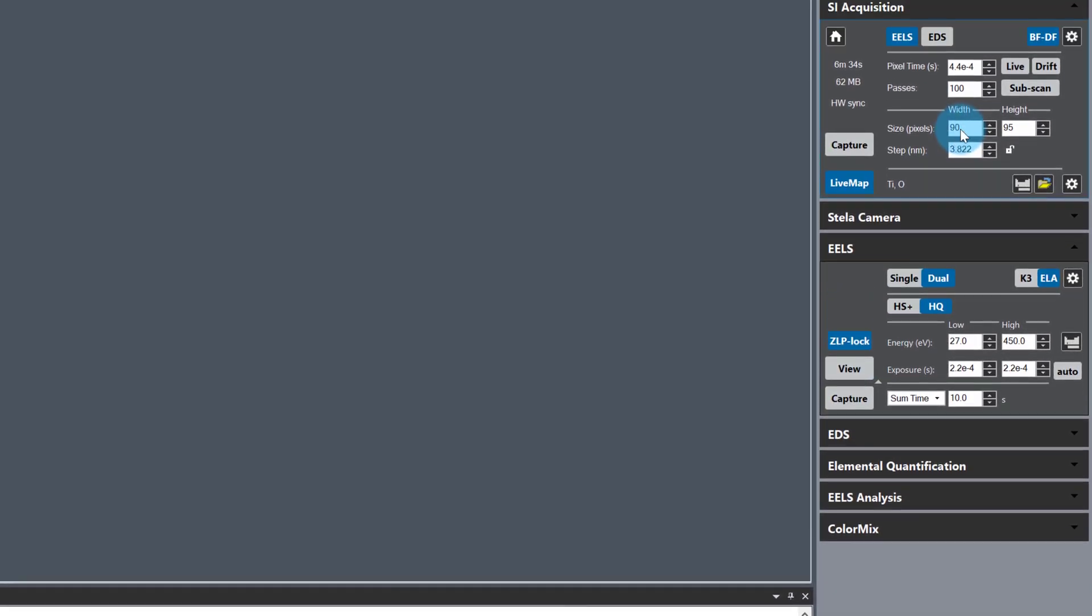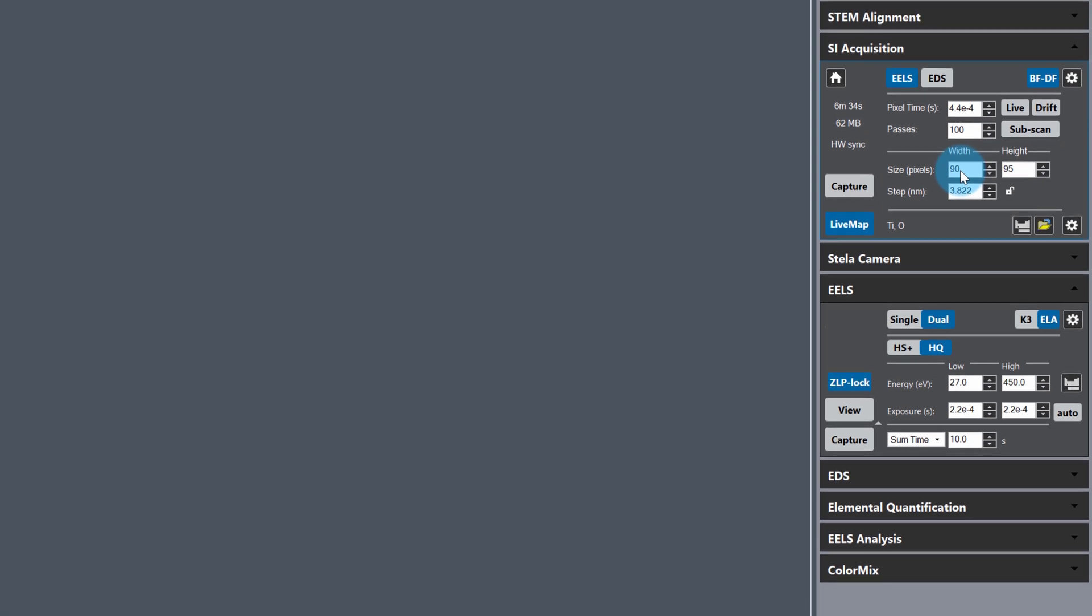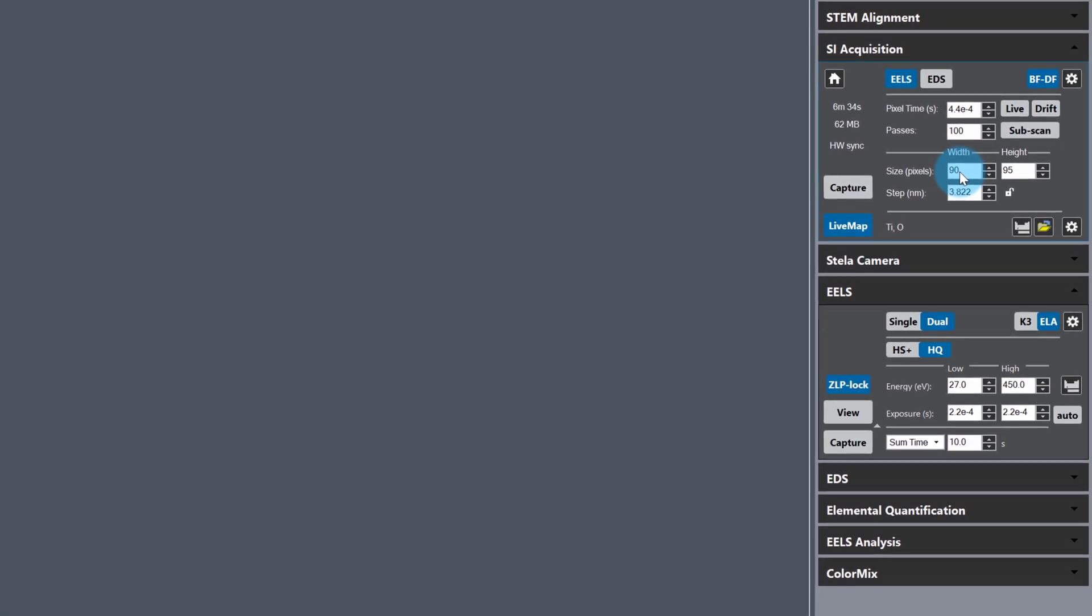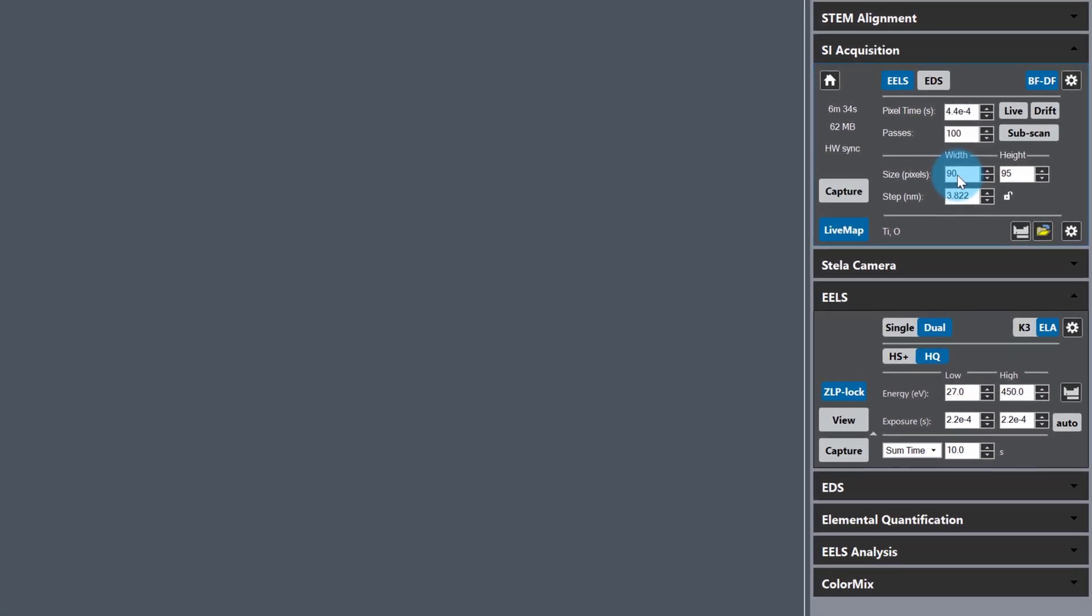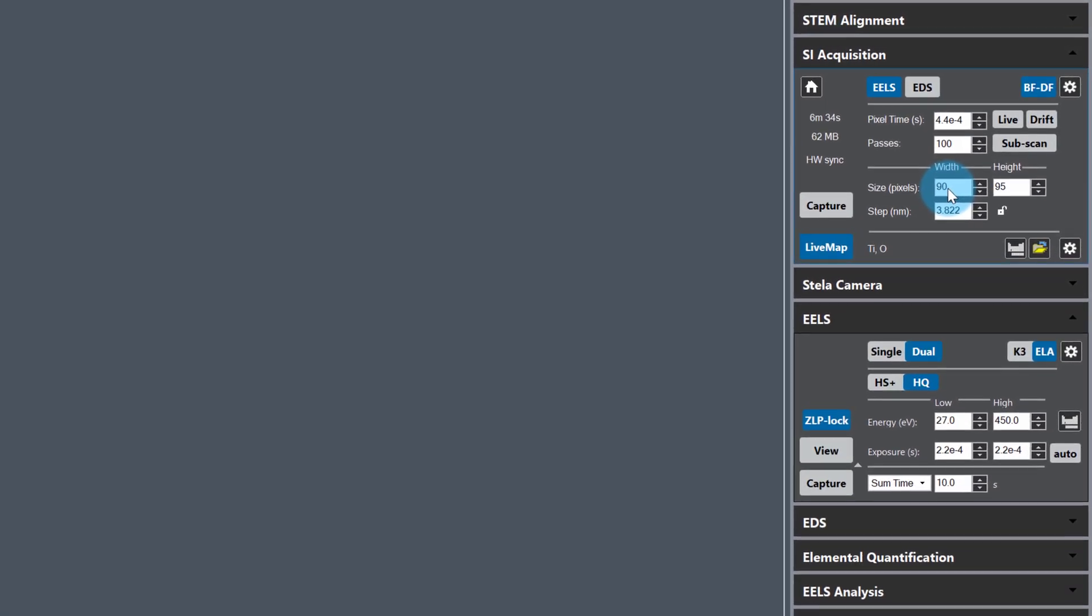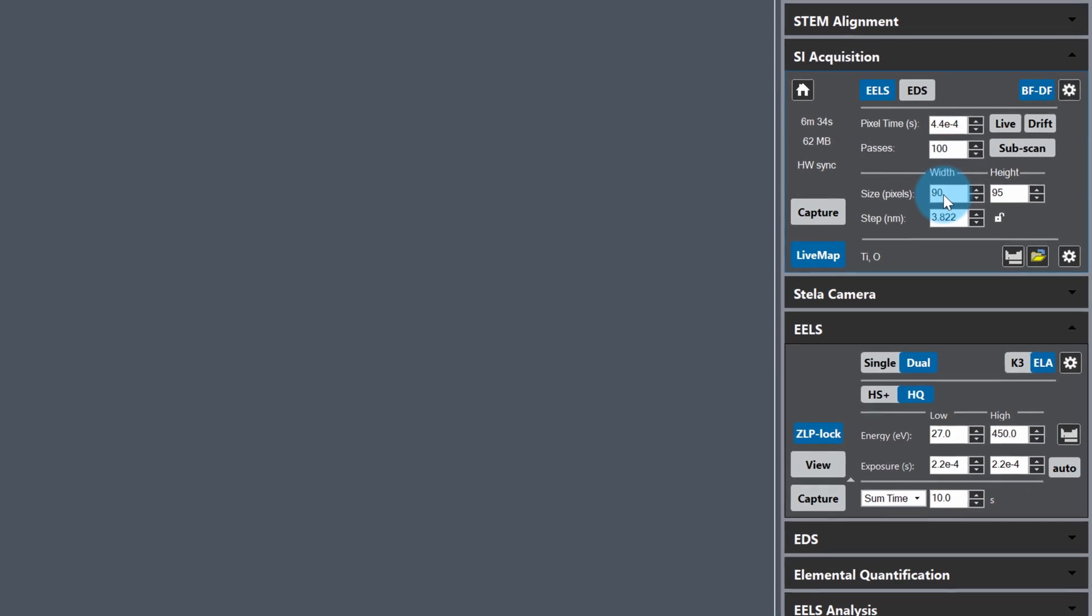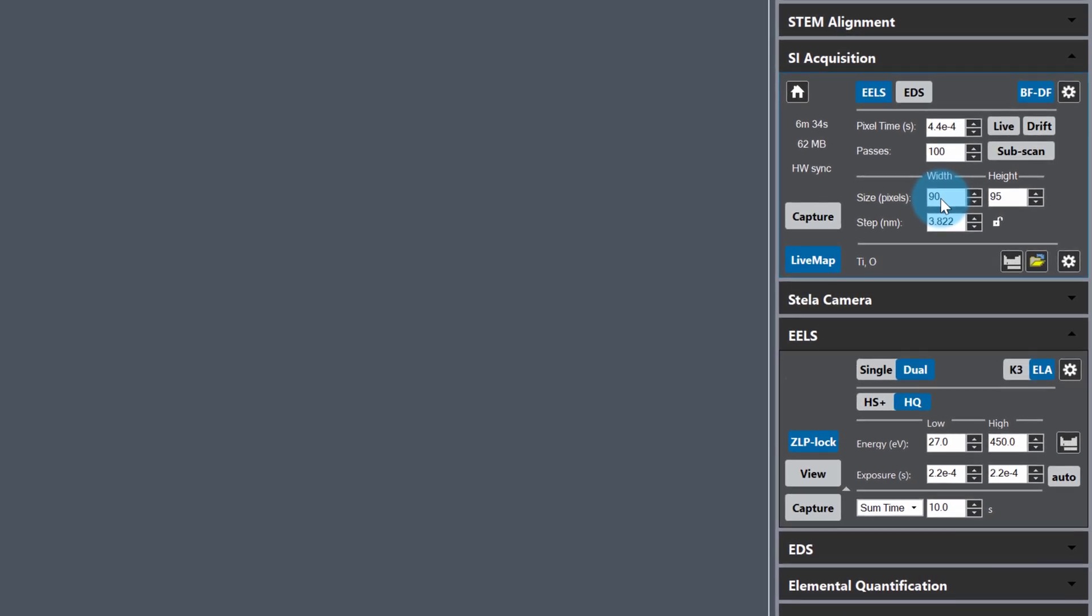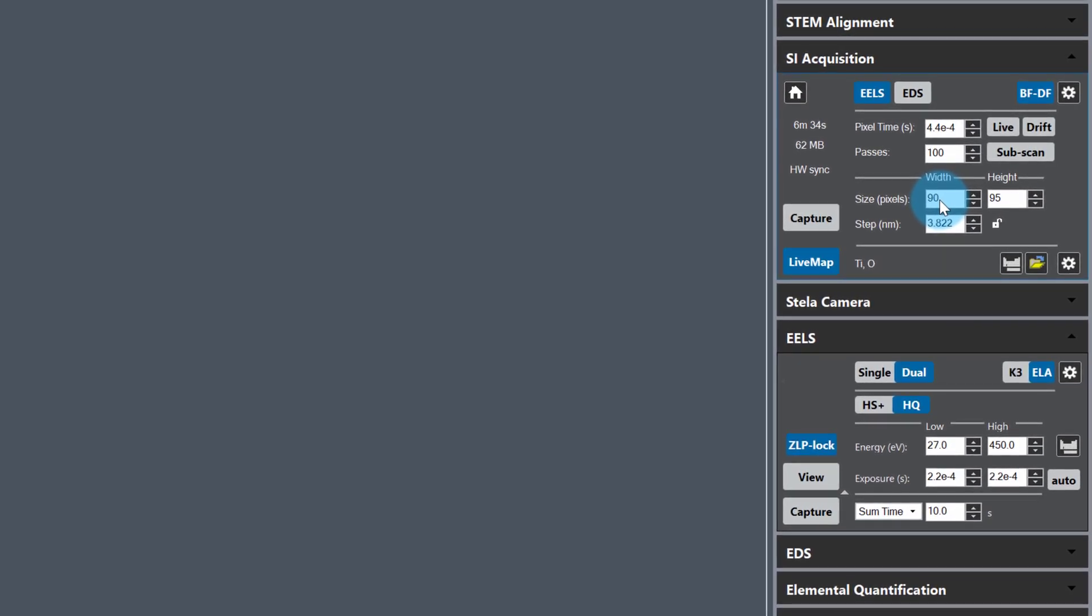As you can see from the SI acquisition palette, I'm going to acquire a 90 by 95 2D array spectrum image with 100 passes. I've also enabled live mapping so I can monitor the signal to noise ratio live so I can stop the capture early if I want. Now all I need to do is hit capture.